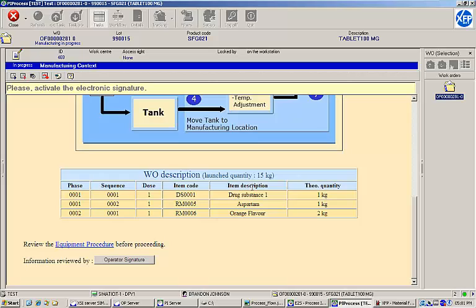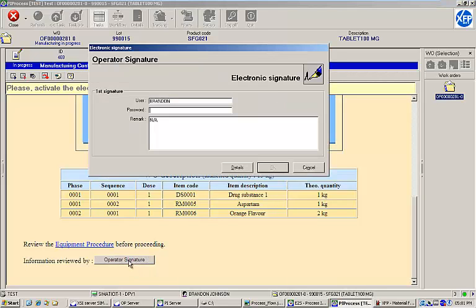clicking the Operator Signature button allows the operator to input a username and password to record an electronic signature. Once the signature has been recorded, the task is complete and the operator is automatically returned to the task list and shown the next available task in the workflow.